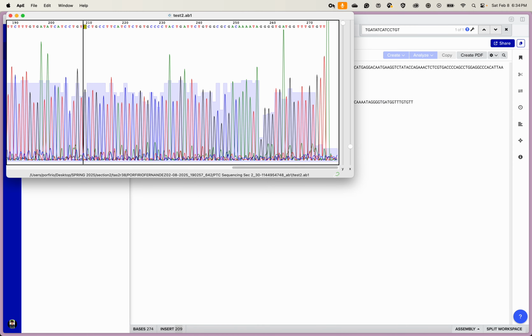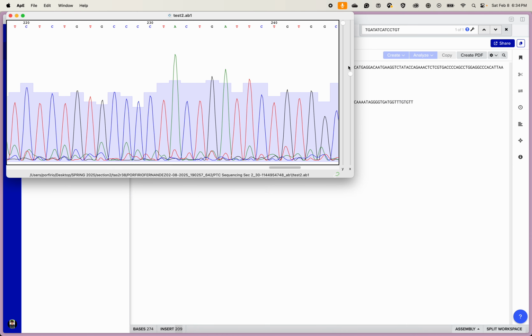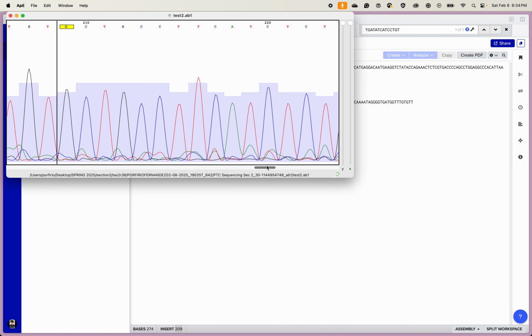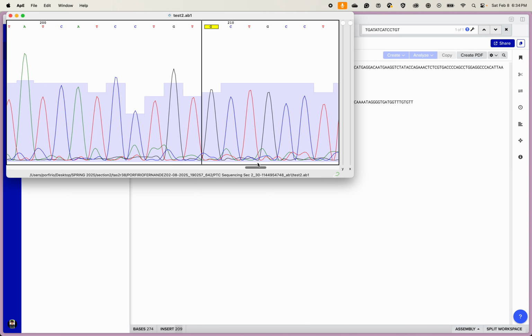With this, you can go here, you can go here, and then we're going to go back to 209. Look at that, 209. And it is indeed GCT, okay? So this person has the wild type taster copy. How about that?